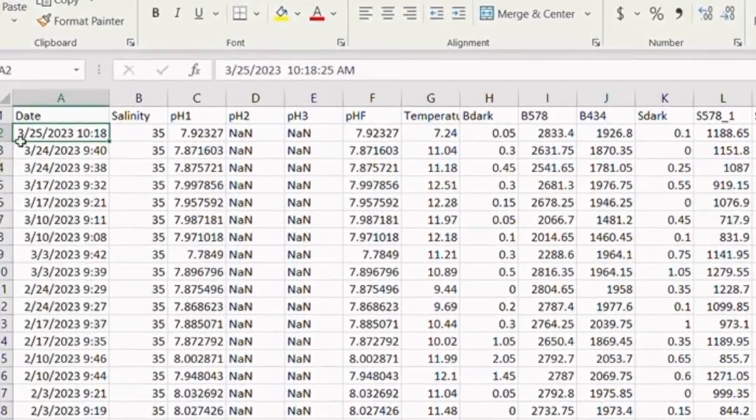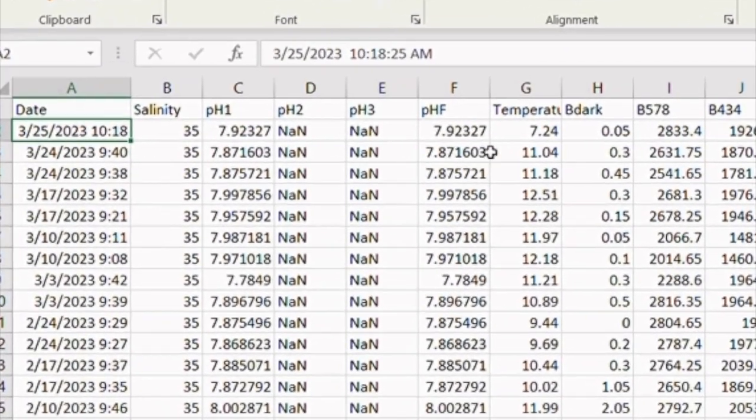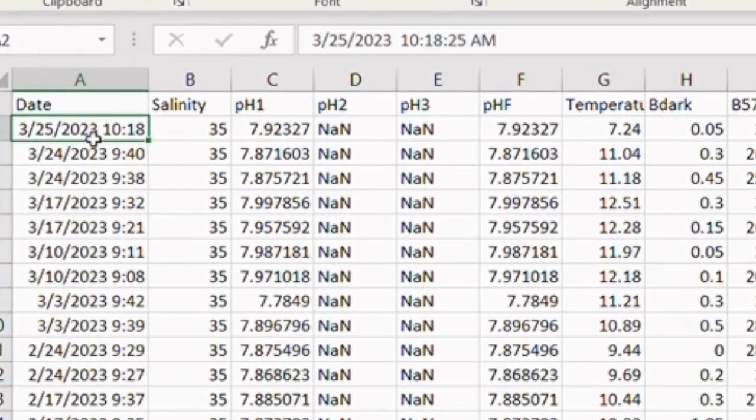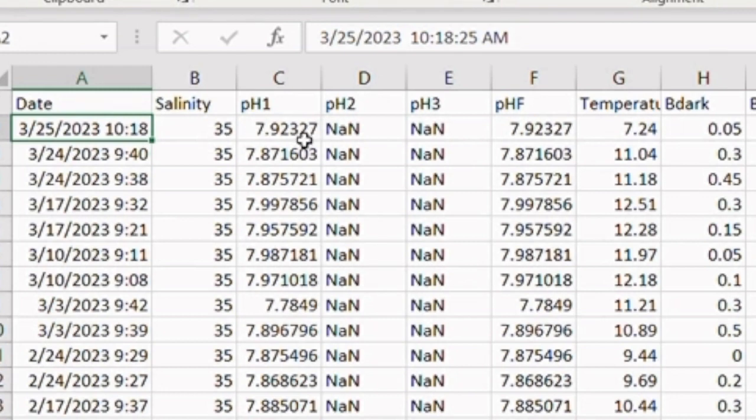So the latest measurement is on the top here, and it reports the date, the time, salinity, and the pH. If they're done in triplicate, you get multiple readings here.